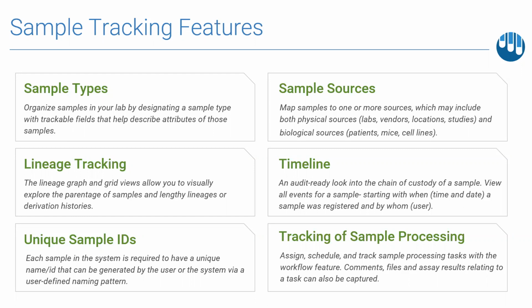And last but not least, to track the processing of samples through a sequence of operational tasks using the inbuilt workflow tool, for example, so that both users and laboratory managers can efficiently track and measure work within their workspace. Now, importantly, the order of this workflow is not in any way fixed. Again, speaking back to the flexibility of the platform, users have a complete choice as to which data types they capture and track. And the UI can be configured to support any variation of your preferred workflow.